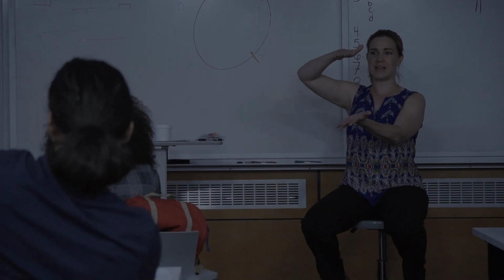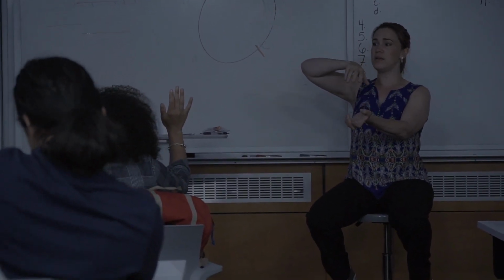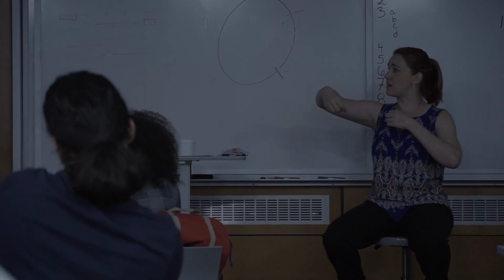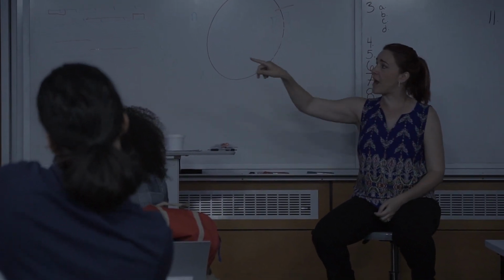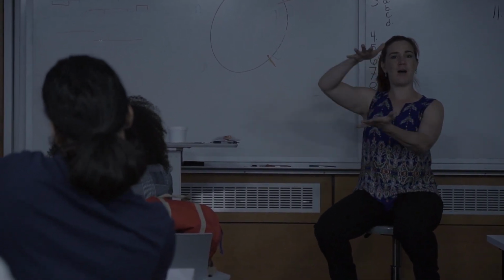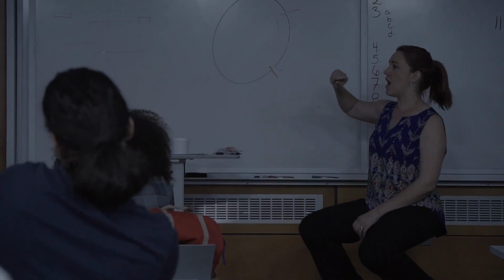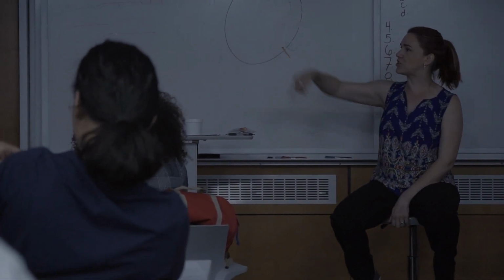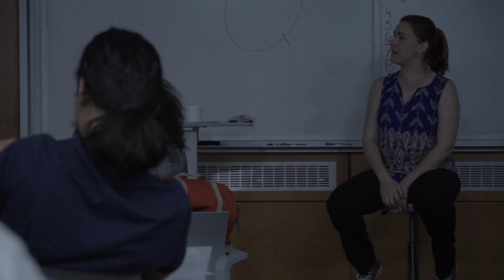And then what's the last thing? Yes. The extension, right? And so that's what Mike's saying. If that's not long enough, you might end up with fragments that are shorter than you expected. And so then depending on where it might be going wrong, you'll end up amplifying the wrong size band, which is why it's really important to check on a gel and see.